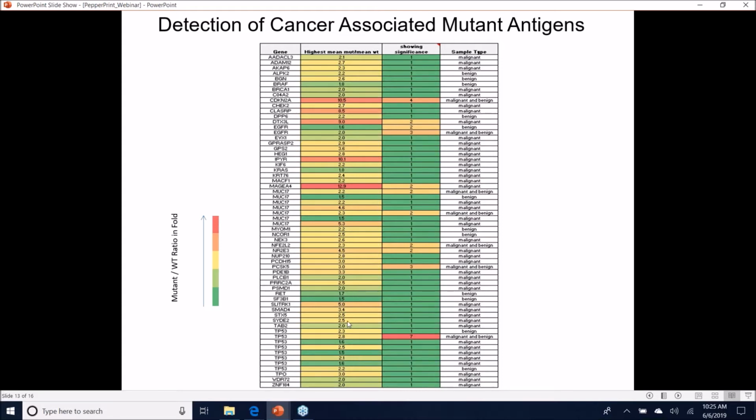And you see mutants, you see a number of others: BRCA1, CDKN2, CHEK2, and a number of other proteins that are present. In that paper, we reported 149 putative tumor antigens that can potentially be useful for downstream studies.